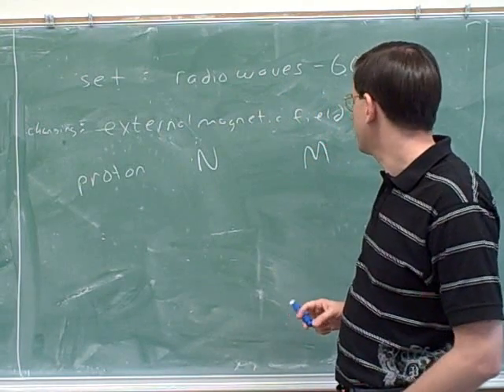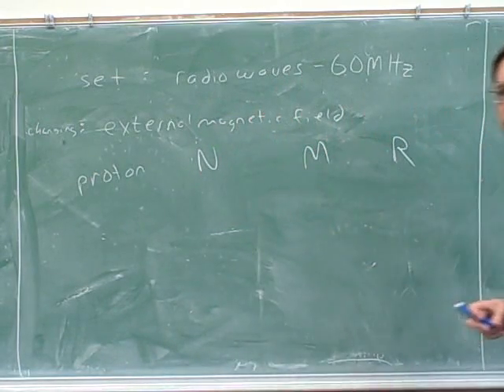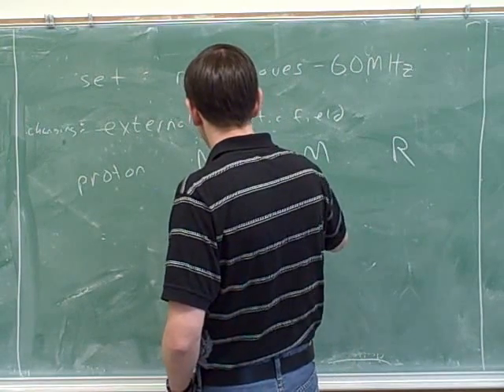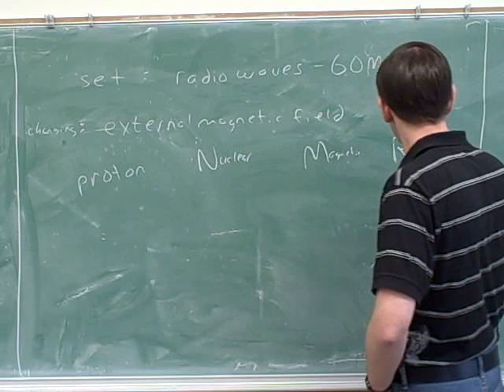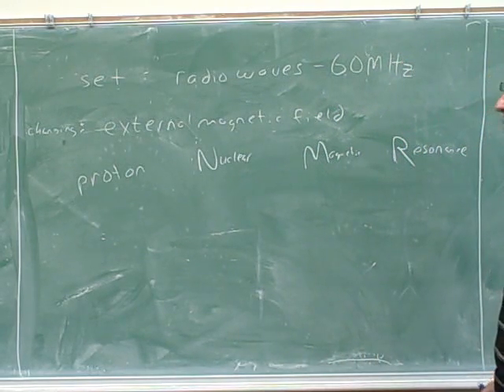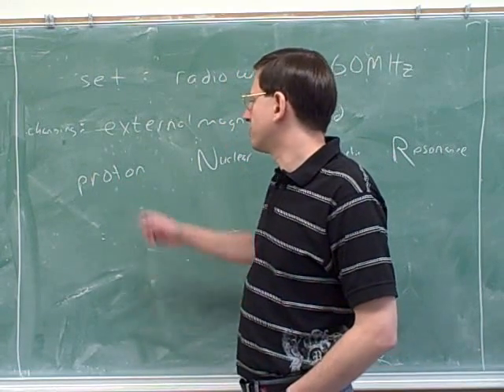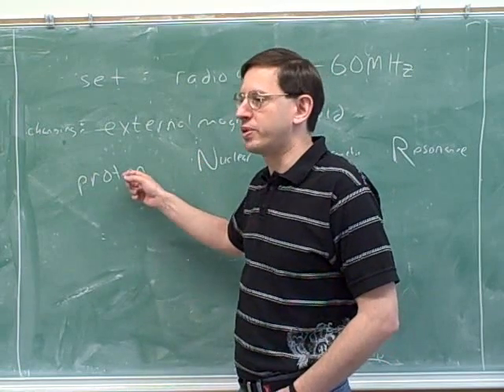So again, the name of this technique is proton NMR. Do you guys know what the NMR stands for? Nuclear magnetic resonance. That's right. All right, and now we can understand the different parts of this name. Why is it called proton NMR? Because we're measuring the absorptions by the protons. There are different types of NMR, but today we'll focus on proton NMR.